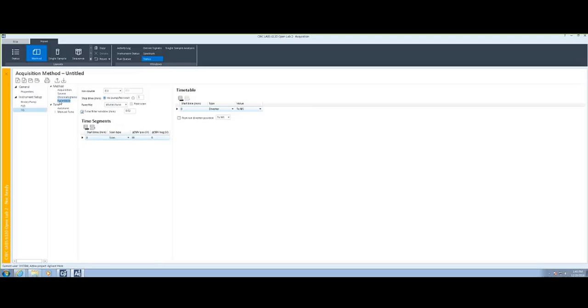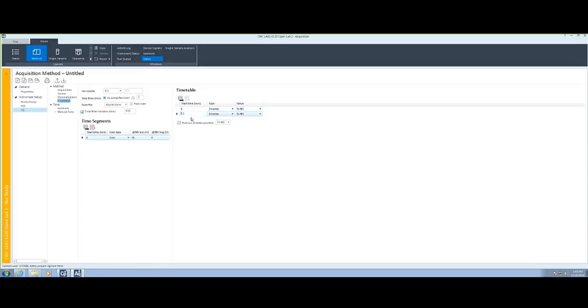The timetable allows you to switch the diverter valve. If you have a five-minute mass spec run, at the end of that five minutes, you can have the valve change from going to the mass spec to going directly to waste instead of continuing to go to your source.